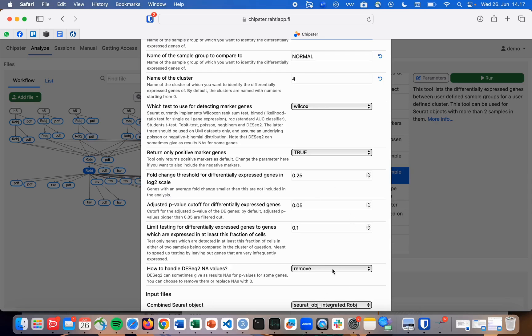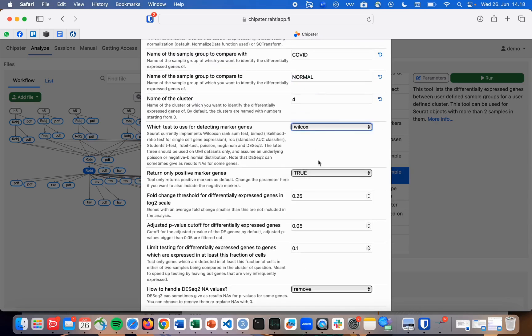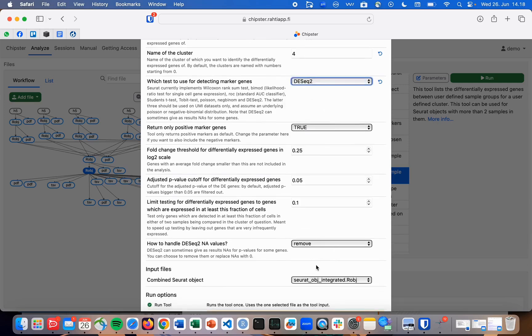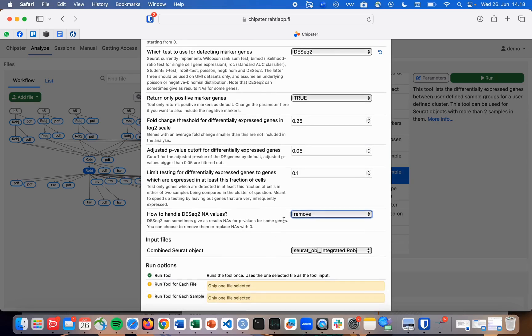However, please notice that if you choose DESeq2 as the test method, it can return NAs as p-values in some outlier cases. Here, you can choose how to handle those values. The NA values are given as a separate output file, should there be some.